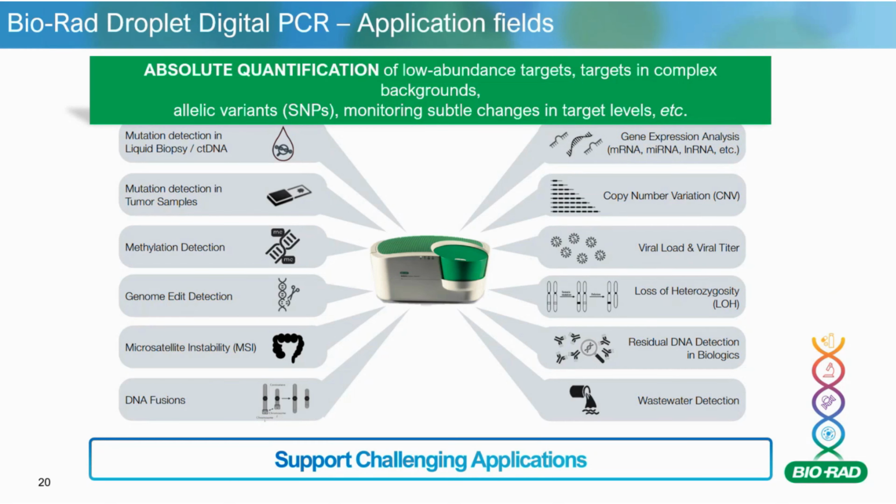However, with droplet digital PCR, you're partitioning your sample into your droplets, and then whatever the enzyme is stuck with in a droplet, it kind of has to run the full length. So you find your data is a lot less skewed. So in droplet digital PCR, it's the same workflow as you can do for normal library prep. The difference is you're just not going to do the reading portion. You're going to run the thermal cycling profile because the droplets have been generated, and then you're just going to lyse the droplets open, and you'll be able to read your sample with your NGS system.